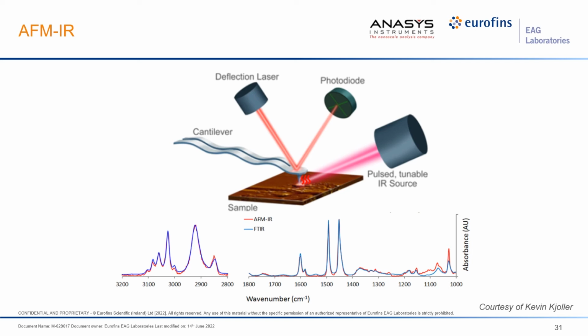This is an extremely useful and interesting technique which uses a combination of AFM and infrared spectroscopy. In the AFM-IR technique, the beam from a pulse-tunable IR laser is automatically guided onto a sample surface that is also co-located with an AFM tip. When the infrared laser source is tuned to a wavelength for which there is a corresponding molecular vibration present in the sample, the rapid thermal expansion due to the heating induces an oscillation in the AFM cantilever.